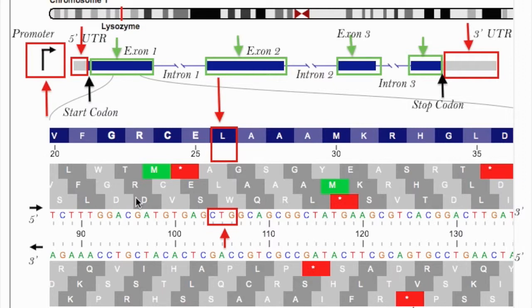Now, how do you tell which frame you're using? Look above to see the protein sequence and find the corresponding frame below. So valine, leucine, alanine, it's in the protein sequence. To find the corresponding frame, you just have to look down, continue down. You see the CTG codon in the DNA. It's CTG, which becomes CUG in mRNA.